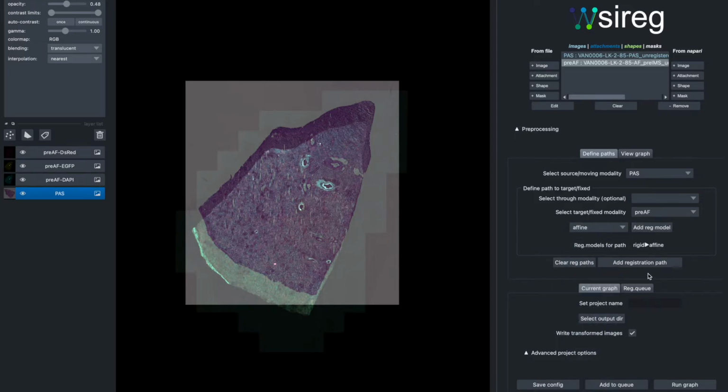First it'll do a rigid transformation to match the 2 images, and once they're already pretty well aligned, it'll do an affine transformation to make slight corrections for differences in scale from different detectors or cameras.